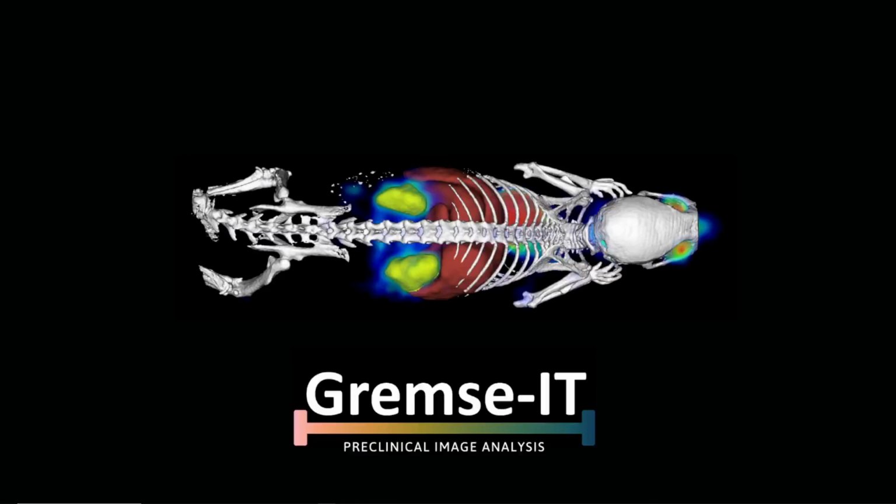Hello, welcome to this video in which I will explain how to use the Imalytics Preclinical software for 3D printing.